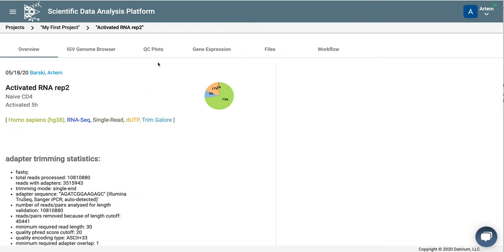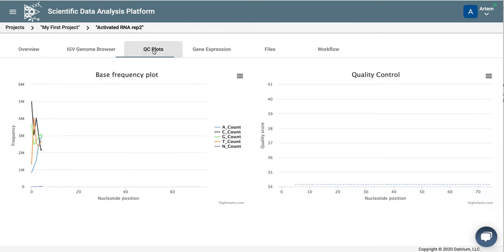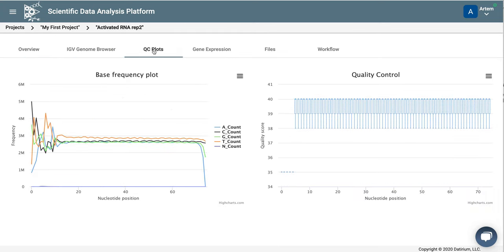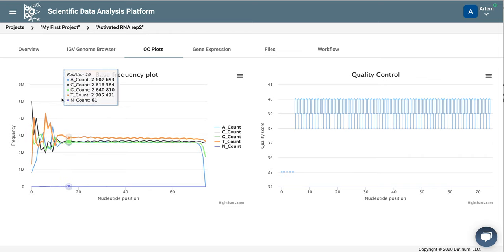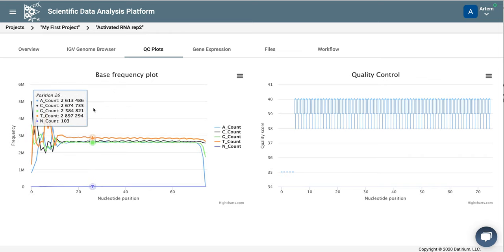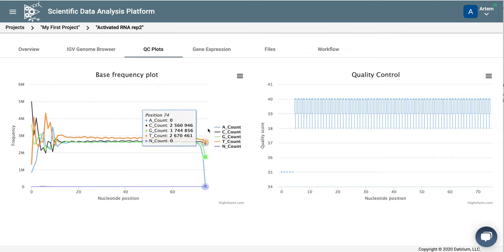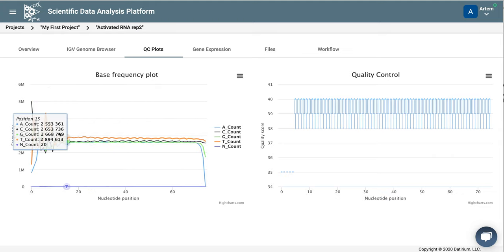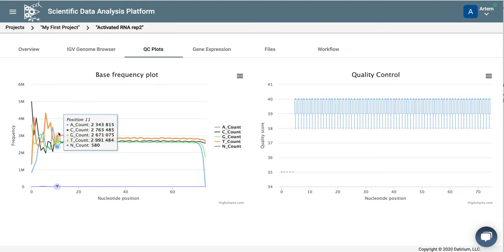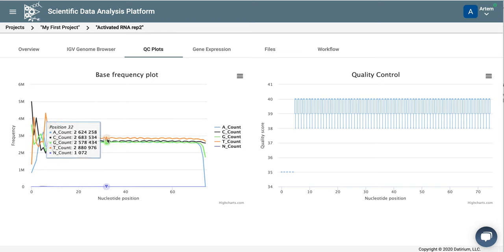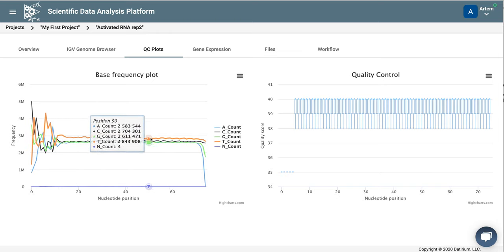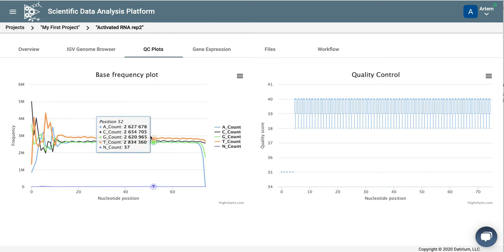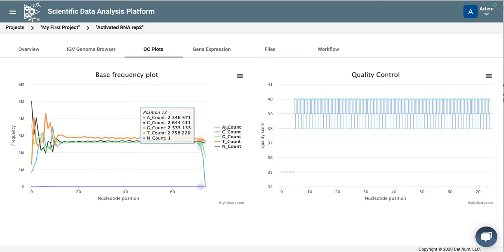Let's look at other quality controls. So here on the left, we have the base frequency plot. This shows you the frequency of each base at each position in the read. As you know, human genome is AT-rich, but the transcriptome is not. And so for this reason, you have almost the same frequency of all four bases.